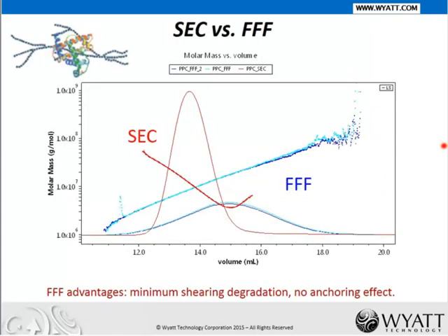The first protein-polysaccharide conjugate example has very wide molecular weight distribution, varying from 1 million to 100 million. The results from SEC, in red, showed a molecular weight decrease with elution volume initially, then curve up at a tail region.